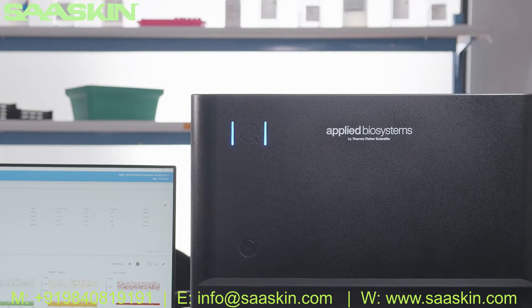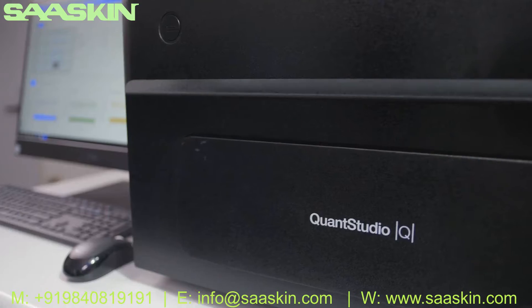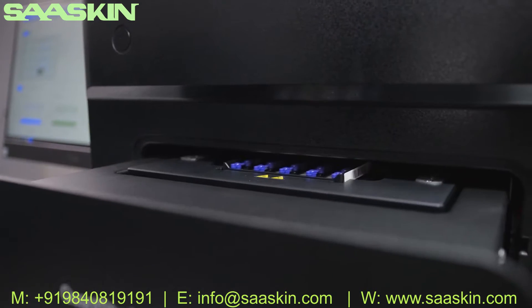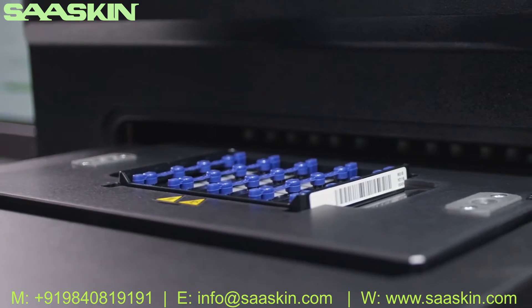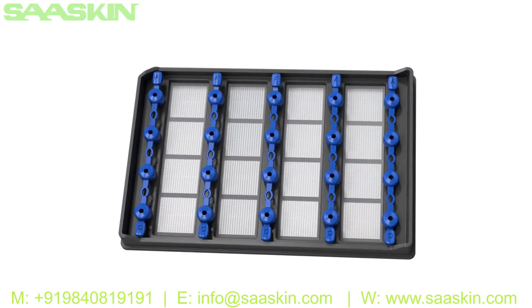At the heart of the QuantStudio Absolute Q Digital PCR System is the novel microfluidic array plate technology. This technology was developed for maximum consistency and accuracy by minimizing waste and maximizing reagent distribution into microchambers. And all you need is one plate and one instrument.